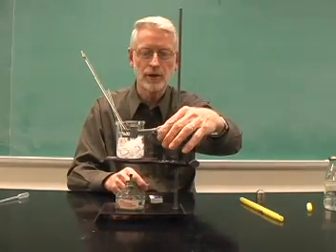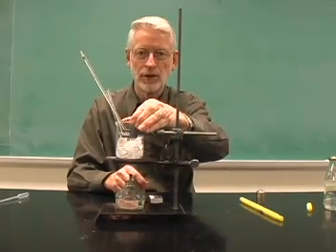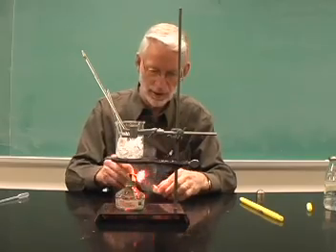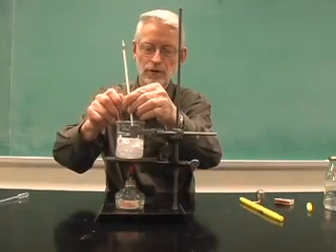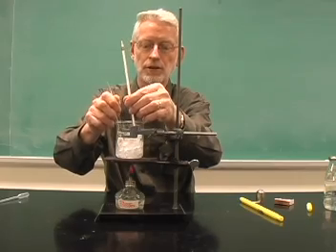And then I've clamped it in place using a clamp to make sure that the beaker doesn't fall off during the activity. So we'll turn the heat on. Temperature right now is, as you might expect, 0 degrees Celsius.